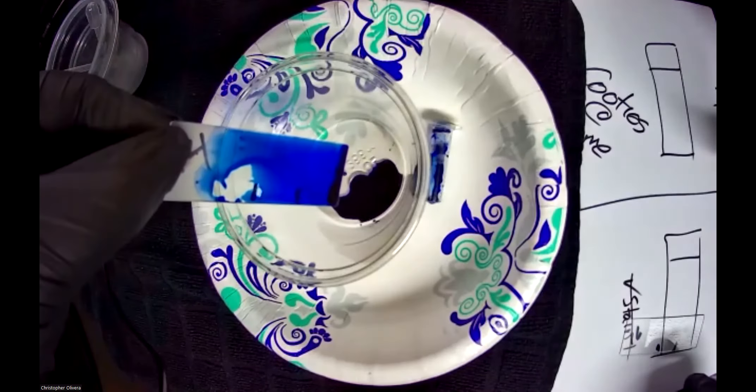Now we reach the final minute of our stain — '16-4', this is your safranin, nice and reddish hue. Same idea, flood it on top and let it sit for a minute. Grab a little bit more water while waiting. Let's say a minute has passed — let it go into the receptacle, waterfall again, never hitting the slide directly, just hitting the number or your fingers. It's nicely rinsed out, and voila — we are done. Gram stain completed for slide 16.